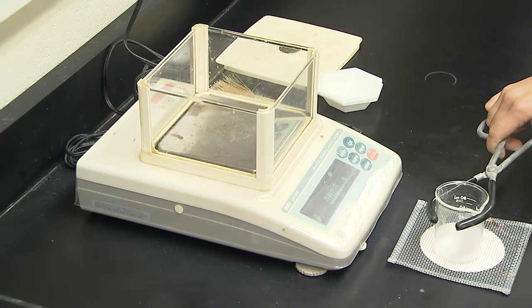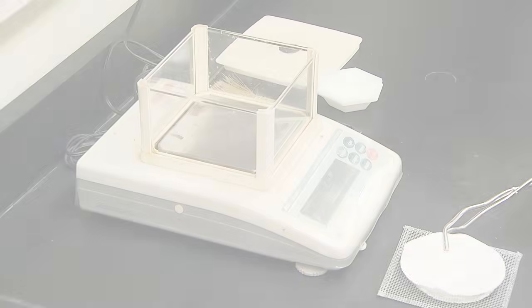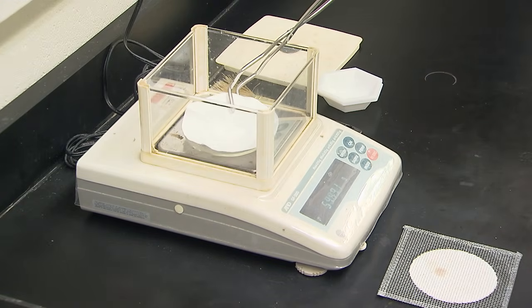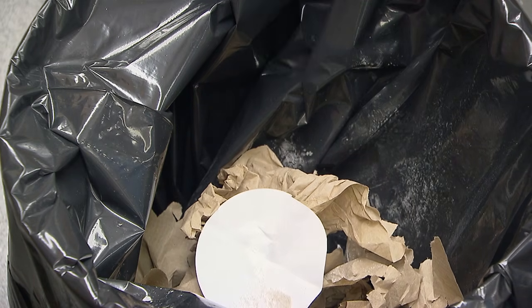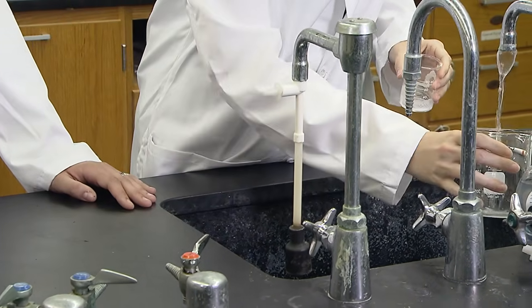Allow beaker 2 and the watch glass to cool before using tongs to take them to the balance for their final mass. When finished, all solid waste can be thrown in the trash, and all liquid waste can be poured down the drain. Then everything can be washed.